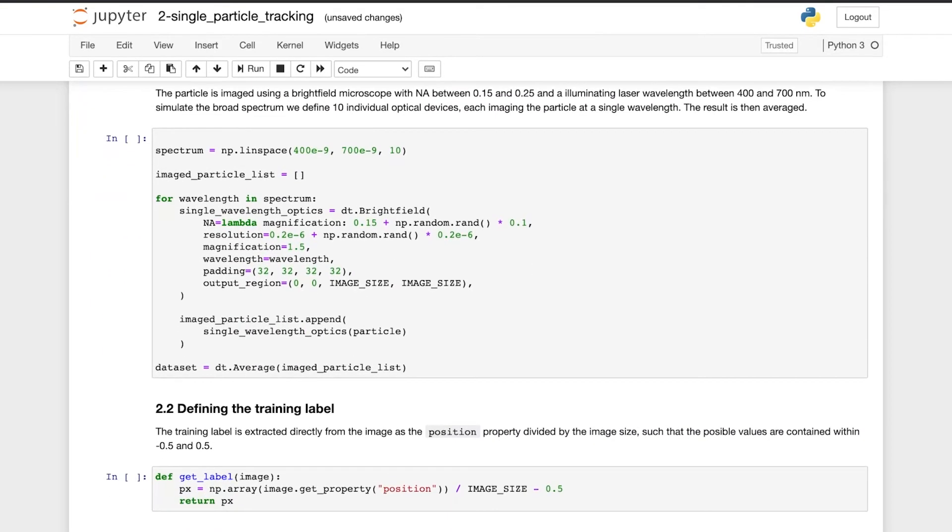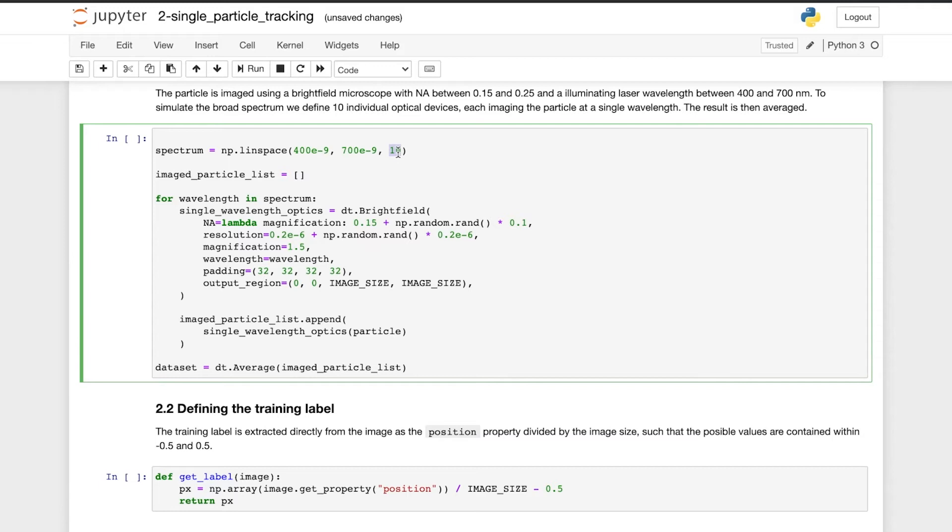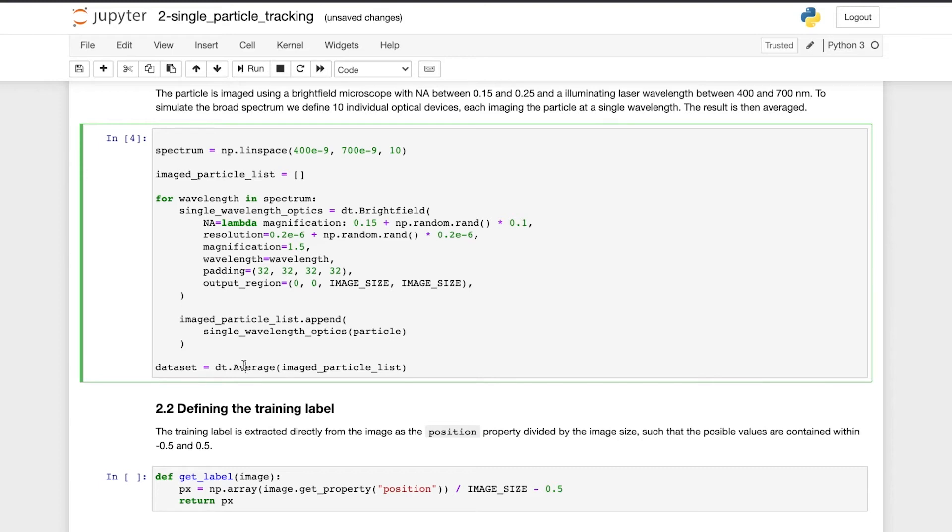Now that we have defined the particle, we will image it. The particle is imaged using a bright field microscope with numerical aperture between 0.15 and 0.25. We also define the resolution and magnification of the microscope. To simulate the broad spectrum of bright field microscope, we define 10 individual optical devices, each imaging the particle at a single wavelength between 400 and 700 nm, represented in this loop here. The result is then averaged for a single bright field image. We also pad the images with zeros to avoid edge effects and define the region of the image to output.